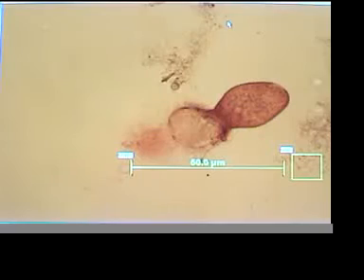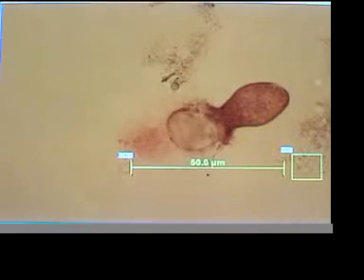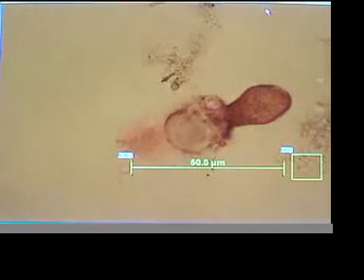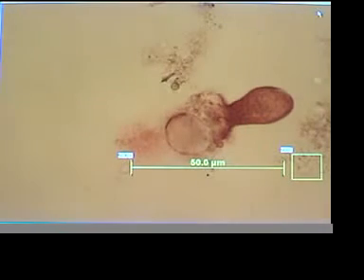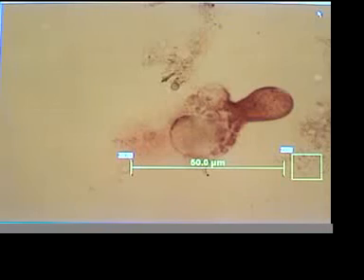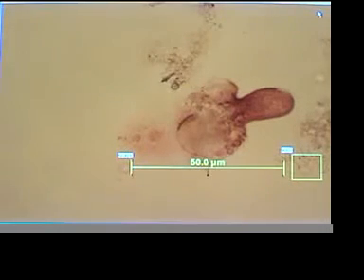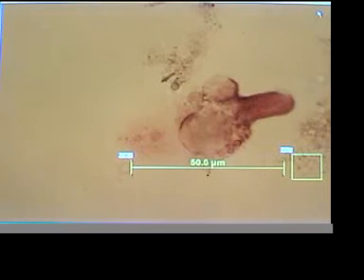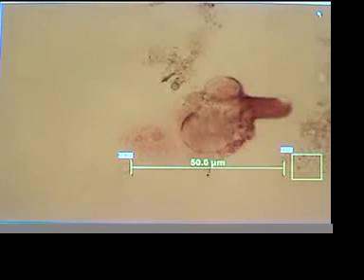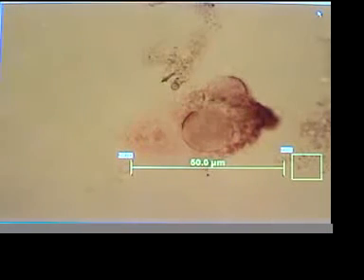Sorry, the computer fell asleep. We still can see the end of the devitalization. It's happening at a very nice speed for photography here. Fascinating the way this is happening. Let's watch carefully. Sometimes a new organism is formed and swims away. I don't know if that'll happen. Let's see. He is completely disintegrated.